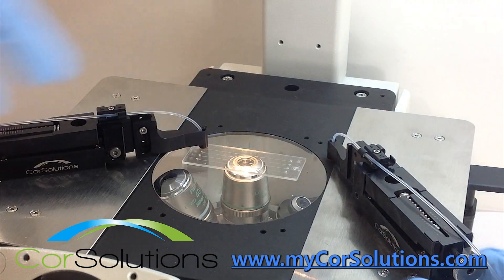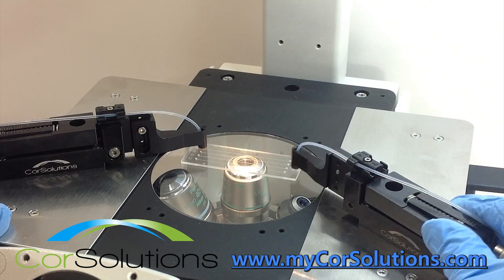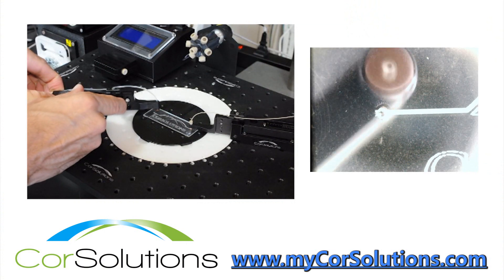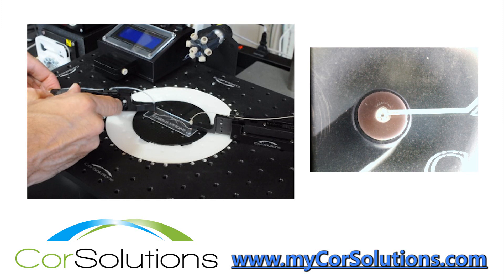The probe features an adjustable compression mechanism that puts a controlled amount of sealing force on the tube-to-chip connection. The adjustable height and removable end attachment holds the tubing inside of the gasket and presses it flat against the chip's surface.